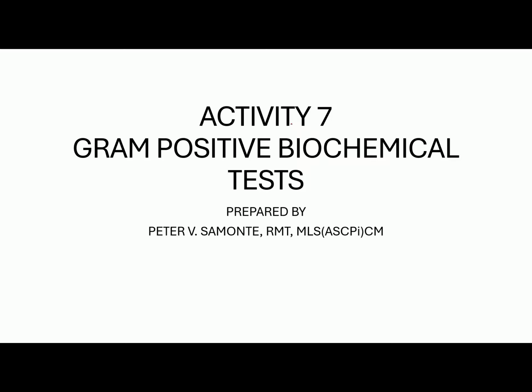So, for our meeting, I'm going to explain to you Activity 7, which tackles the gram-positive biochemical tests. This test class is used to identify specific gram-positive cocci and bacilli. So, let's discuss them one by one.